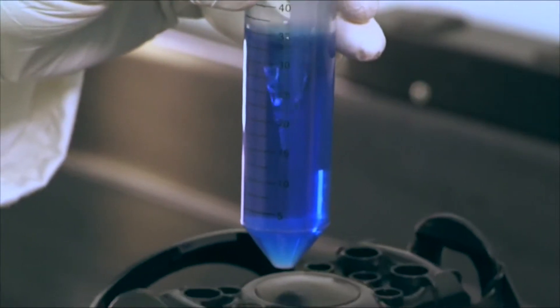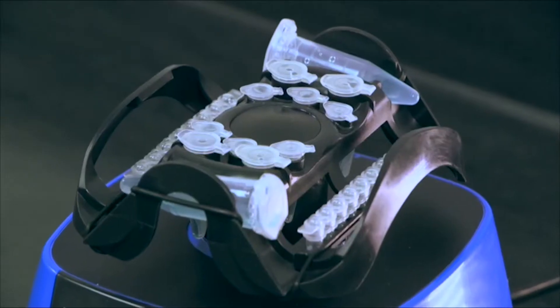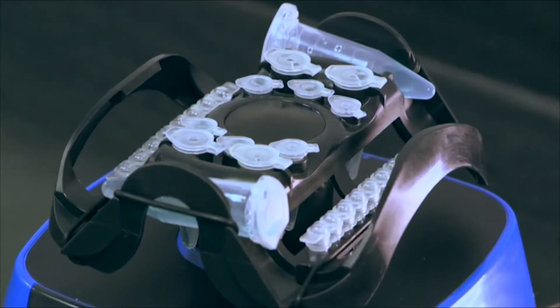A truly great product is ultimately defined by its functional design. Introducing the Vortexer — an innovative design using one mixing head for a variety of tube sizes.